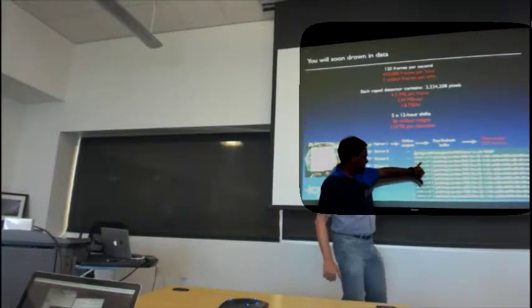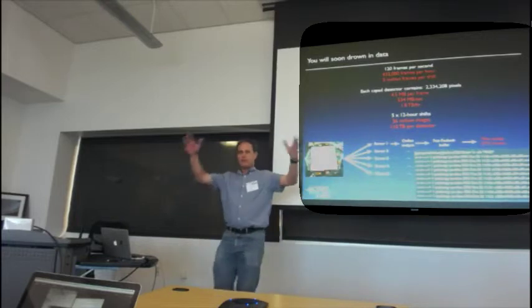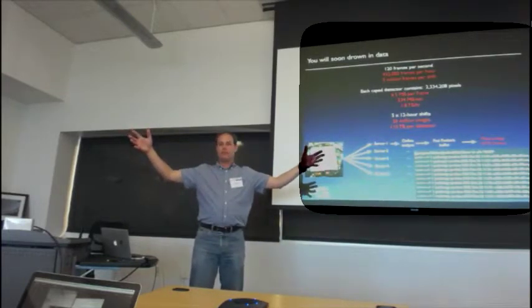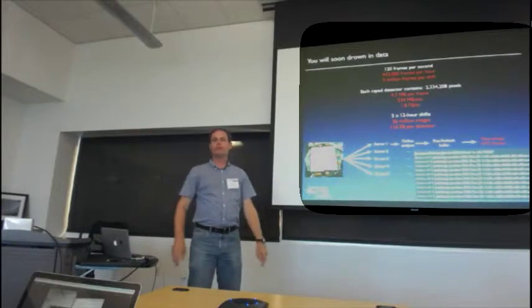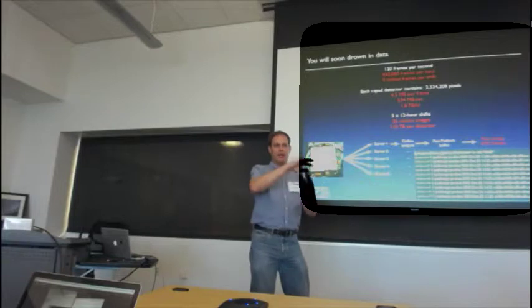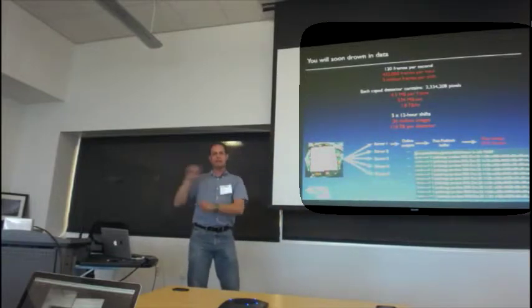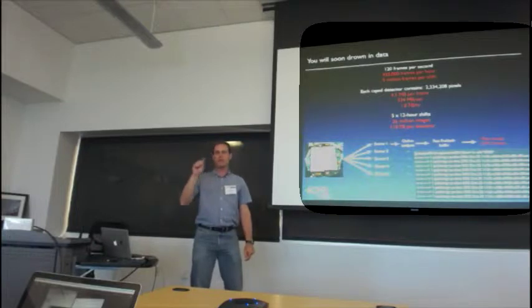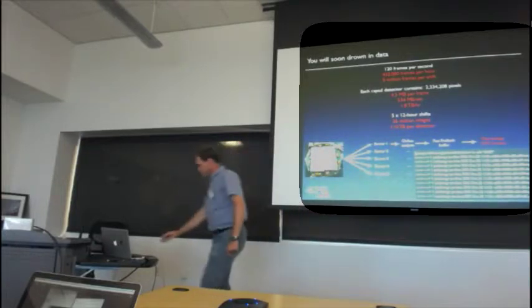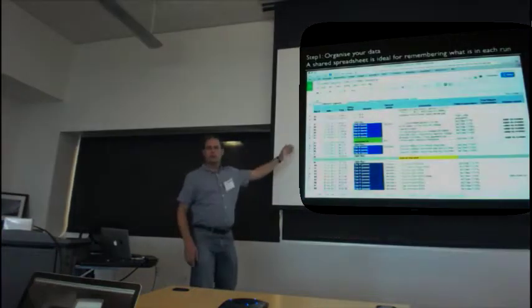Now you've got all of these things. The way the experimental people at LCLS run it, they sit in front of this control screen, and the finest granularity you have in practice is something called a run. There's a button there that says, start recording the experiment now, and it records it faithfully like a tape deck, all the data to disk, and then stop recording. Start, stop, and please save this. Those are called runs.